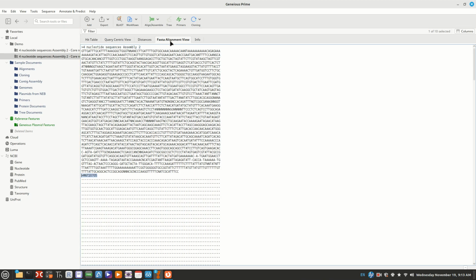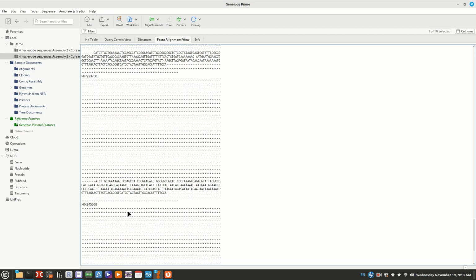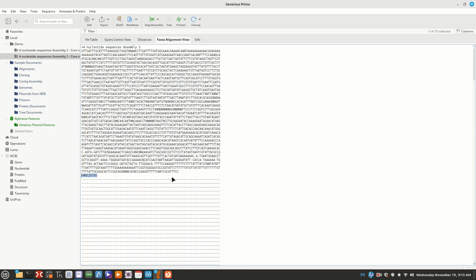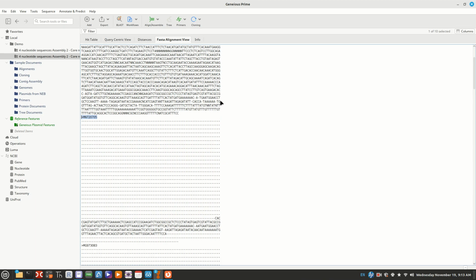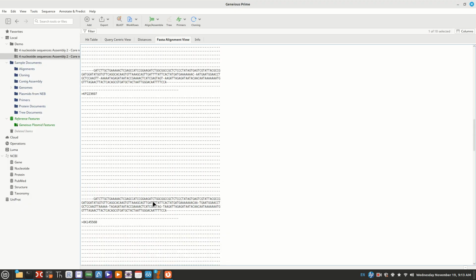and here. If you go to FastA alignment view, each of these pieces down here are hits from some other gene or something that they have stored in the database. And these are all vectors that are confounding our results. They're overwhelming our results so that all we're finding is this piece, if you'll notice down here. The piece that's aligning really well is at the bottom, about 6 lines up. Again, about 6 lines up. So it's the same piece over and over.